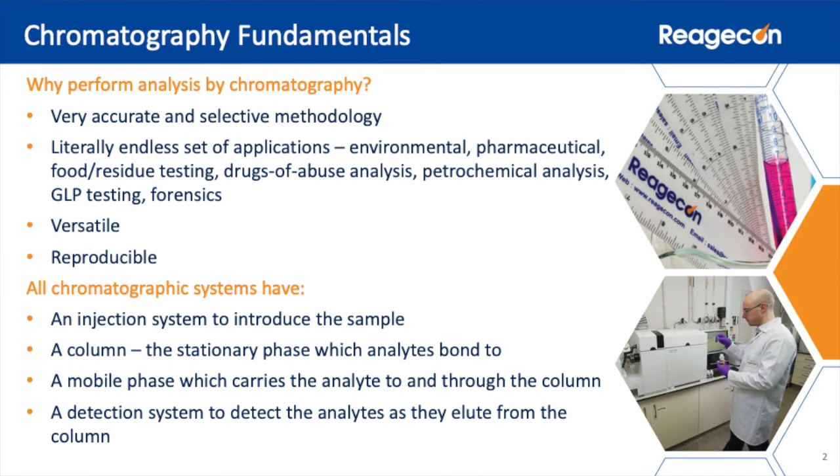So, why perform analysis by chromatography? It is a very accurate and selective methodology with literally an endless set of applications. It is versatile and reproducible.